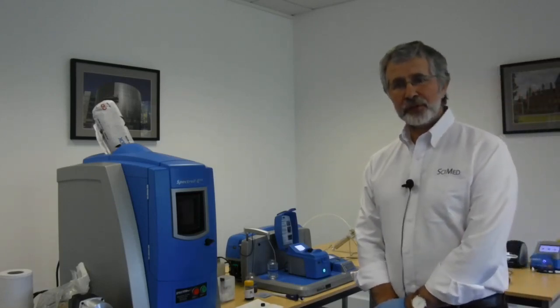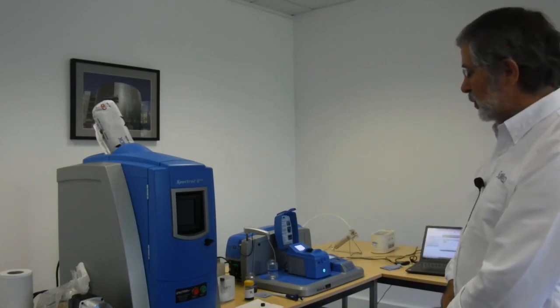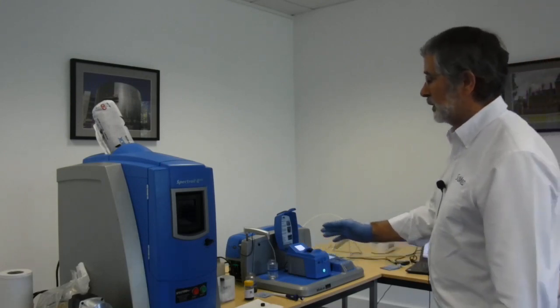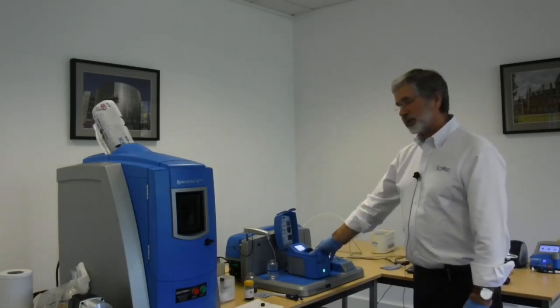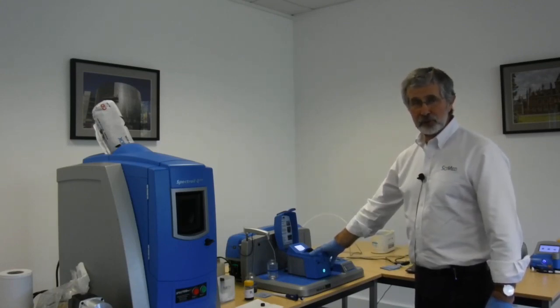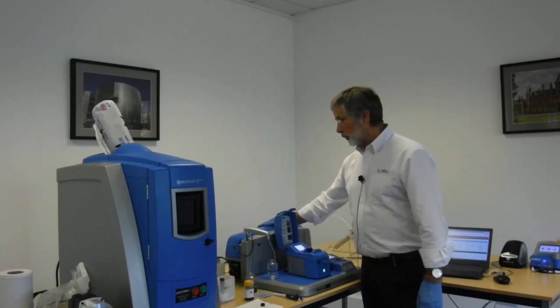Okay, having looked at the presentation, now let's look at the instruments in a bit more detail. What you're seeing here is what we call the Spectro Minilab platform. It's modular. This particular layout would be called a Minilab 153. So we have a wear metal spectrometer, which will do 24 wear metals in about 20 seconds. We have a viscometer, which gives kinematic viscosity at 40 degrees and calculates that at 100 degrees if you know the viscosity index of the fluid in question. An infrared analyzer for the oil chemistry, for things like total acid number, total base number, water, etc. And a 4-in-1 particle counter.